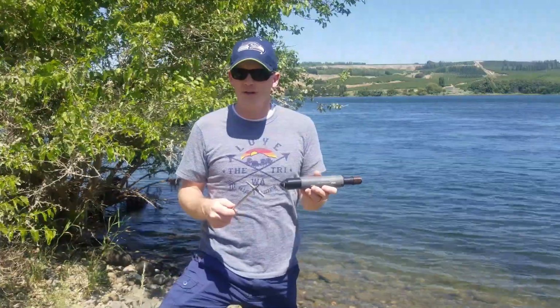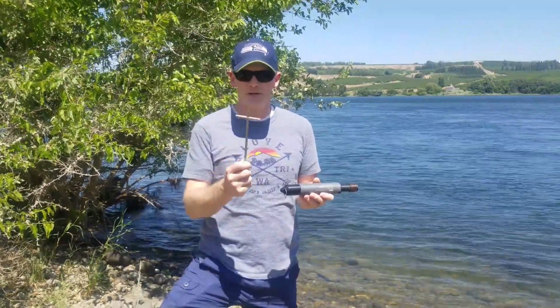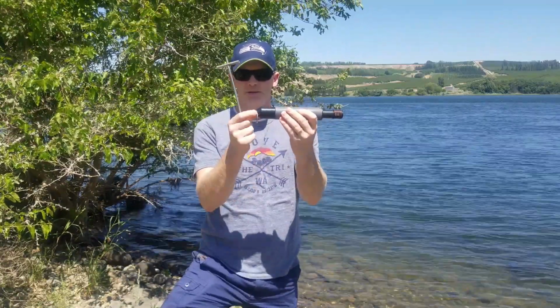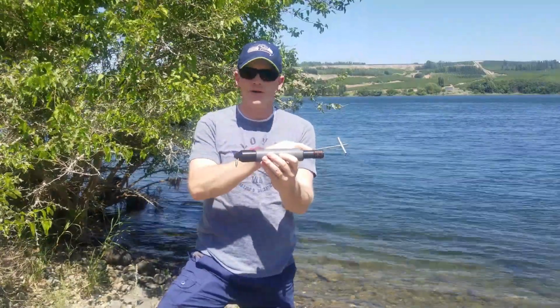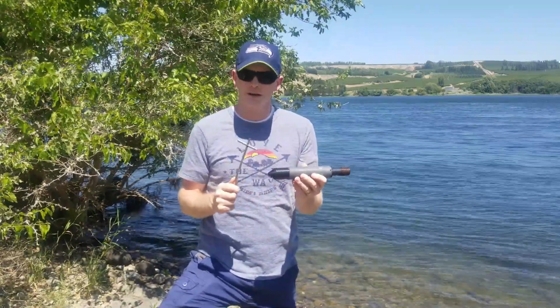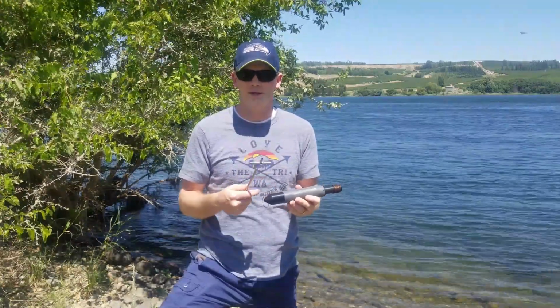If you have a hobo logger as part of your sampling gear, after you install your push points, zip tie or otherwise attach the hobo logger to the middle push point at the top. There's a nice hole at the top of the hobo logger for easy attachment. The sensing part of the hobo is down here. You want that part put out towards the middle of the channel. Also record the time when you put the hobo into the water. We will launch the logger before we send it to you, so we'll already be collecting data.